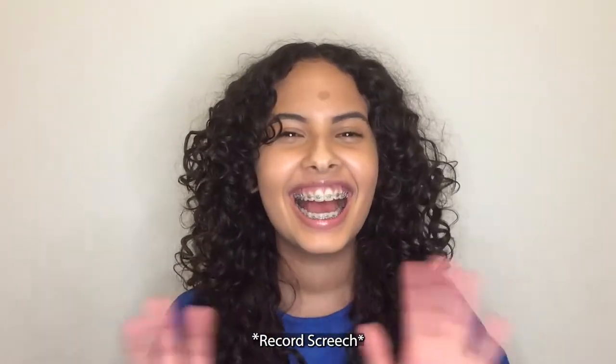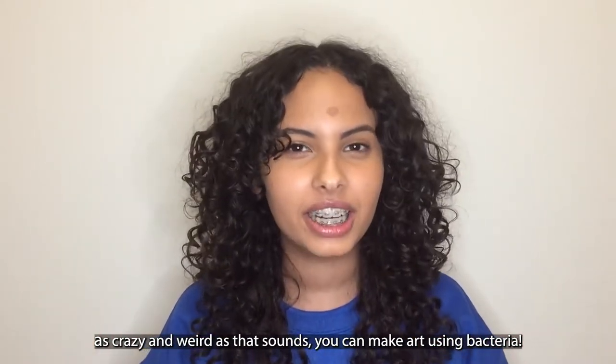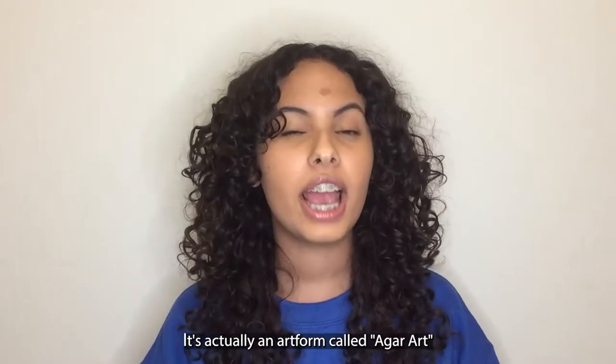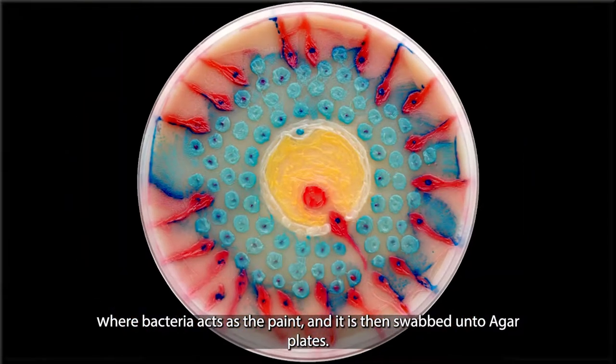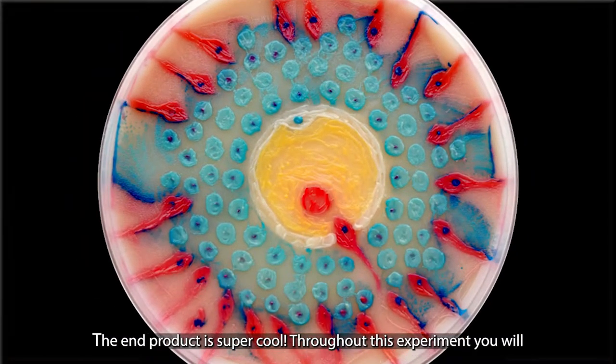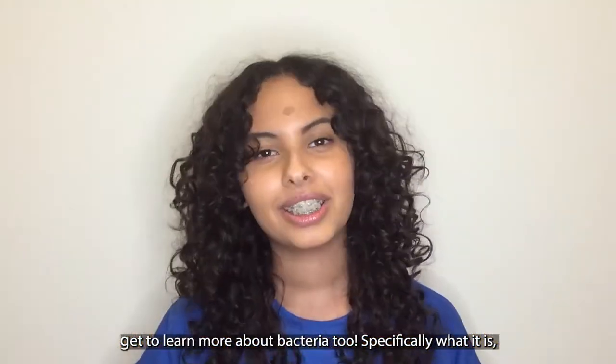As crazy and weird as that sounds, you can make art using bacteria. It's actually an art form called agar art, where bacteria acts as the paint and is then swabbed onto agar plates. The end product is super cool. Throughout this experiment, you will get to learn more about bacteria too.